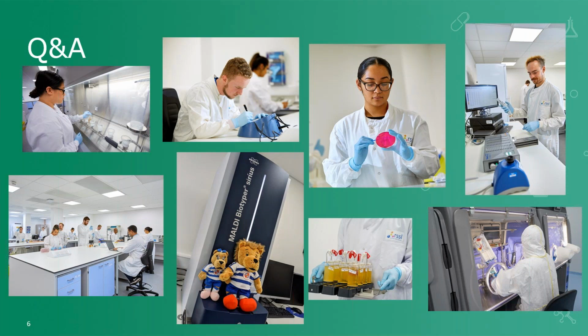Okay, and I have a question from Amy, and she said, how concerned do we need to be if we are detecting low levels of fungal growth in our grade D clean room on environmental monitoring? It's a room they've recently moved into and they didn't see it in their previous room.